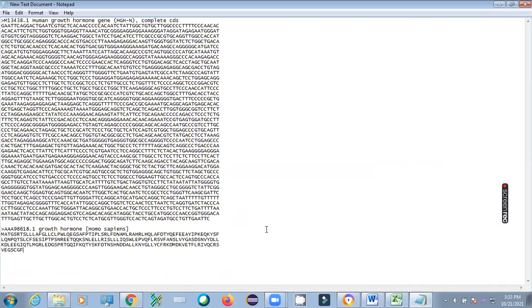So this way we can do this finding the nucleotide sequence of a particular gene. Here you can paste this way you can search. So this is the basic one, and then next day we will discuss further how to analyze these things. So thank you very much.